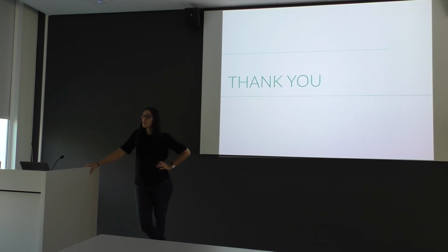If there are slight changes in your eucentric height, certain shifts, calibrations being a little bit off, that kind of thing, I'm not sure if that's true, but perhaps not. Nothing out of the usual in that sense.